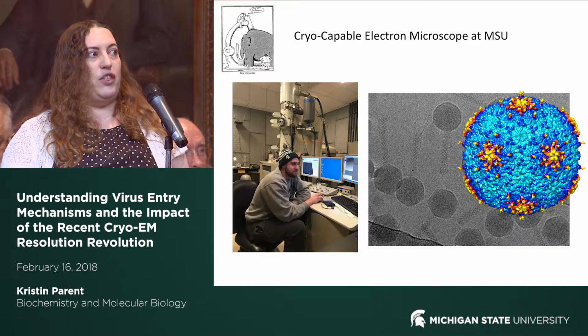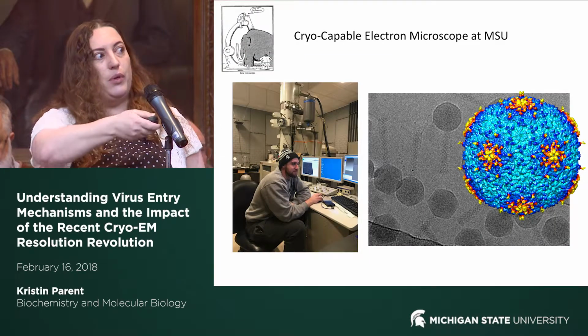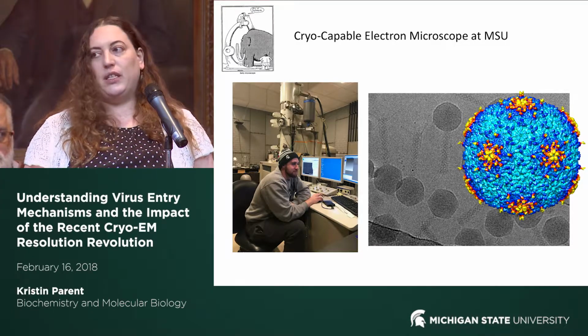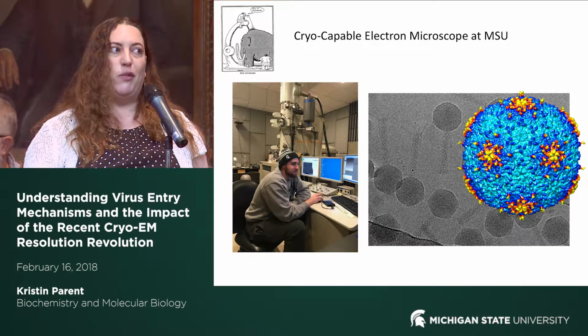So this is an example of a student-based project where an undergraduate in my lab, Will Dean, is on our microscope here. And this is actually a bacteriophage that we isolated as part of a class at MSU's campus from the Red Cedar River.